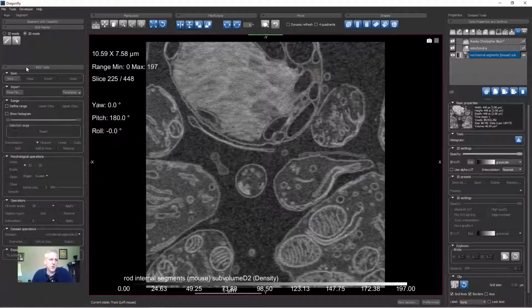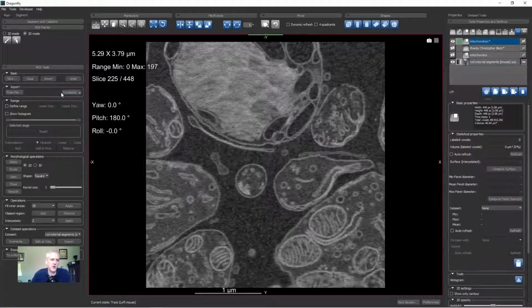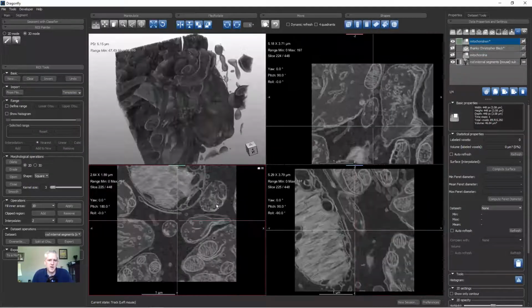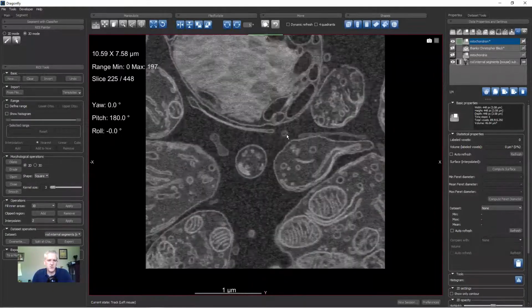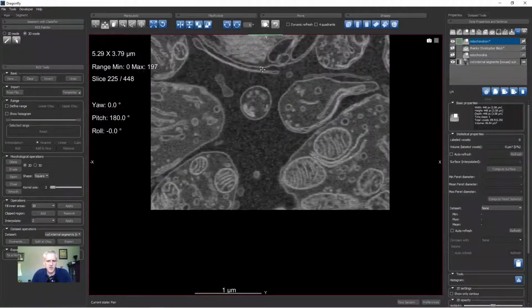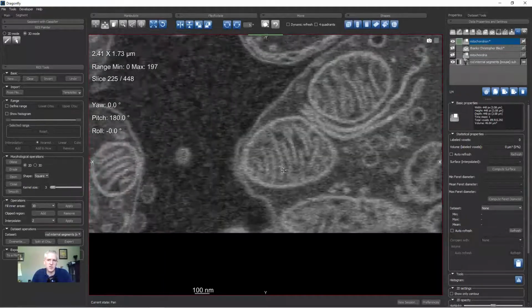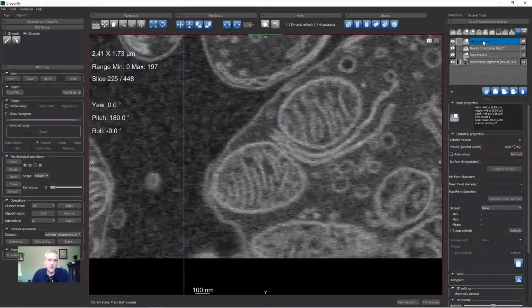So we can do, like we did in lesson 8, we can click New, and now this will allow me to create an ROI. So let's suppose I want to segment a mitochondrion. I can type mitochondrion, and now I have an ROI that is ready for me to paint the mitochondrion. Now I can go to any one of these views. Let's choose the view in the lower left-hand corner. You can use the left and right mouse button to drag to pan and the middle mouse to zoom. So this is what's going to make us productive, is knowing these shortcut keys. Now I have a blank canvas for painting.